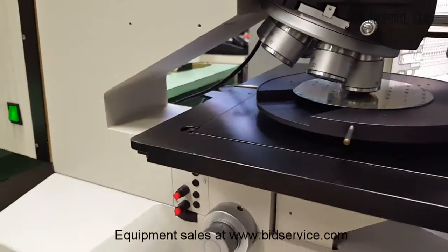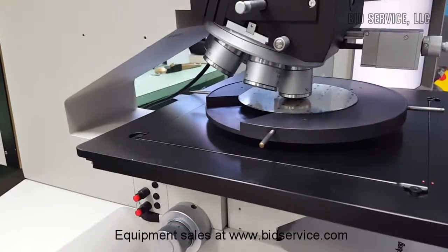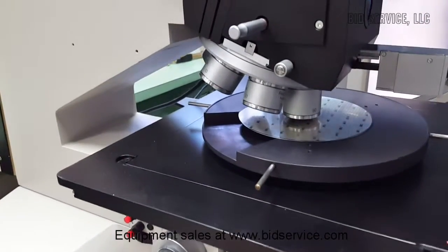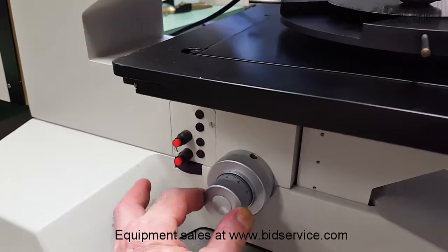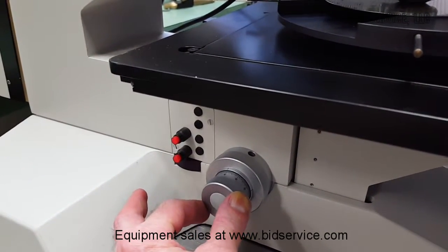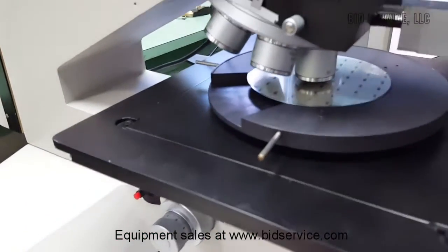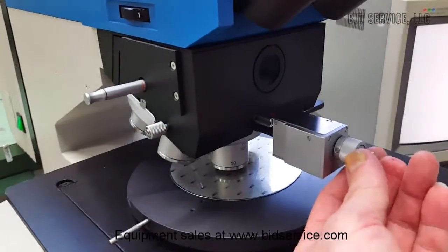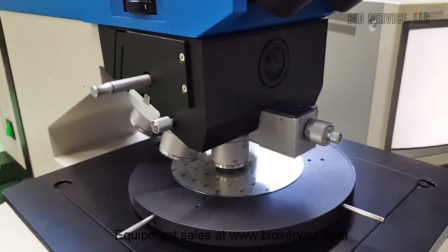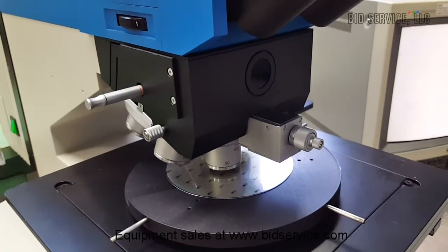Here are your coarse focus and fine focus controls. On this microscope I do have a little bit of fine focus adjustment — probably about that much — between a couple of the objectives, which was the best I could do. Here's your Nomarski prism. I'm going to show you through the eyepiece, as the image is a lot better than looking at the monitor.